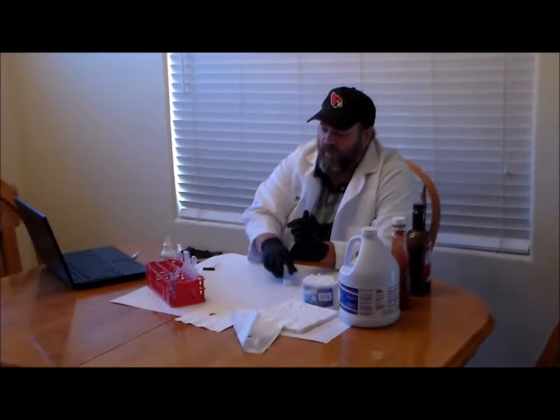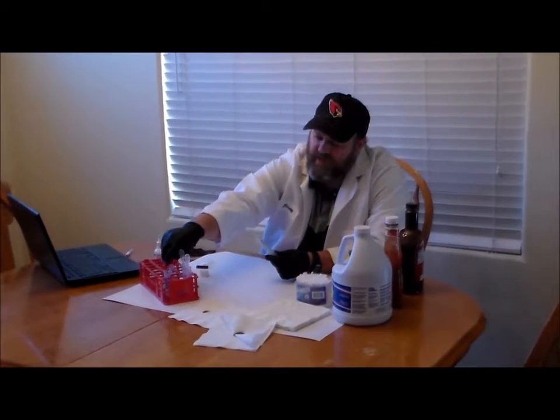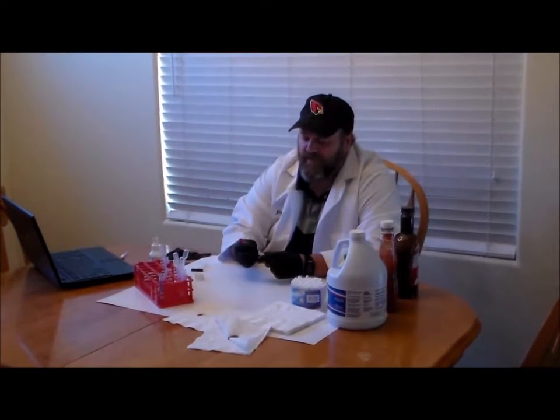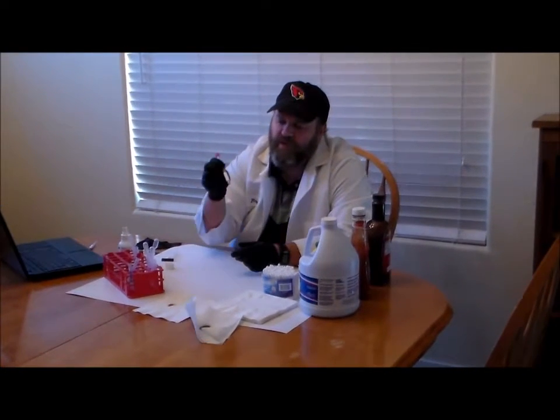Next, put some normal tap water into the test tube labeled 'water'. Also, transfer the contents of the reagent vials into their corresponding labeled test tubes. Normally these vials are meant to be used once on scene by crime scene investigators, but we're going to use the contents a few different times, so we'll pour them into test tubes.